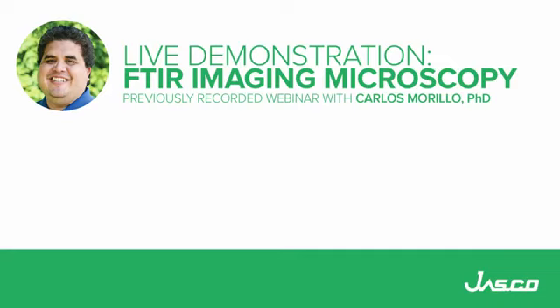Today, I'm going to be using a couple of webcams, so I recommend that you enhance those windows of the webcam so you can have a full view of what I'm doing. Also, I would like to let you know that I'm going to be presenting or demoing two instruments. So there is a moment in the middle of the presentation where I'm going to be switching instruments. So I hope that you bear with me. In a few seconds, I'm going to be changing instruments.